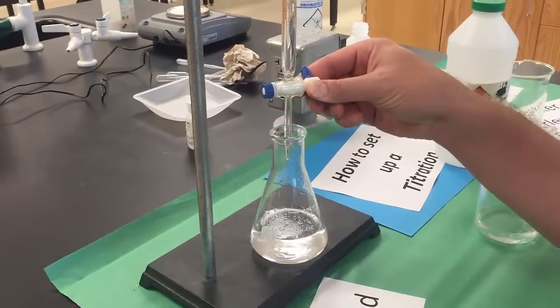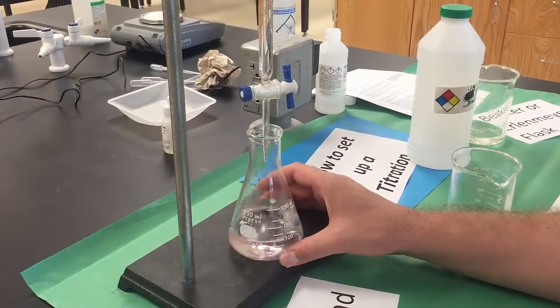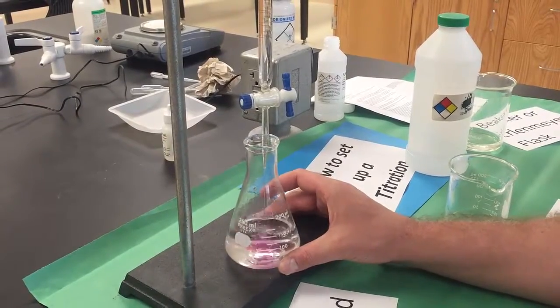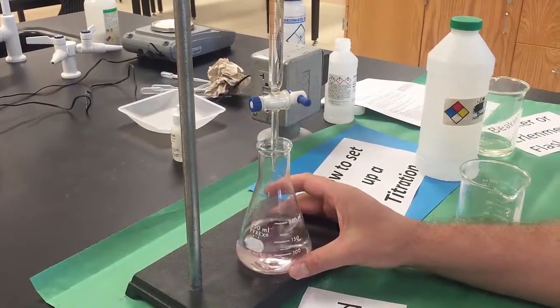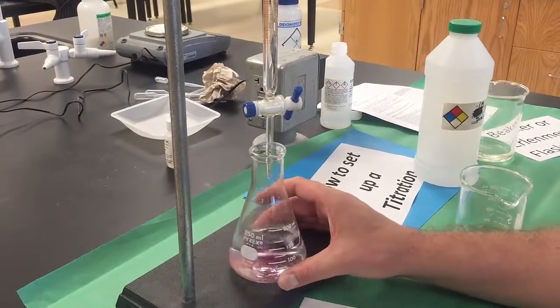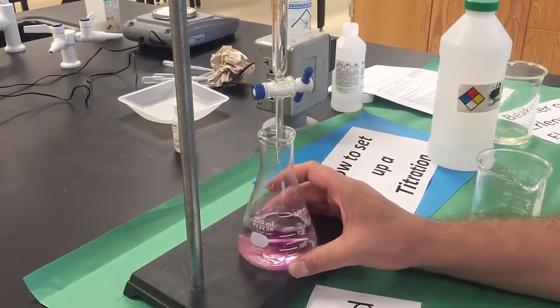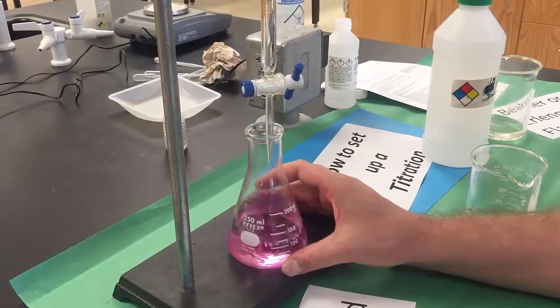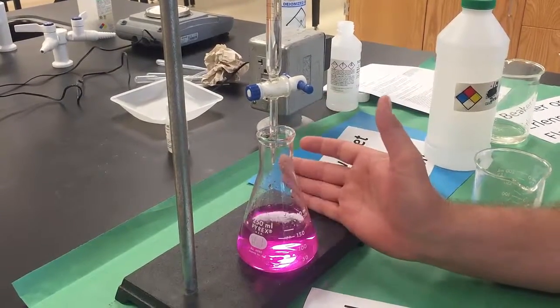What I like to do is my first trial will be a very rough estimate. So I'm just going to let this rip. And you'll notice I'm swirling the whole time, and you're going to get more and more pink color. But if I were to stop and swirl, the pink color slowly disappears. If I continue, a lot of times you can have your lab partner swirl and the other person runs the valve. Pretty soon it's going to stay. We're going to stop it. See how it stayed pink? Now I did a terrible job, but I learned something.